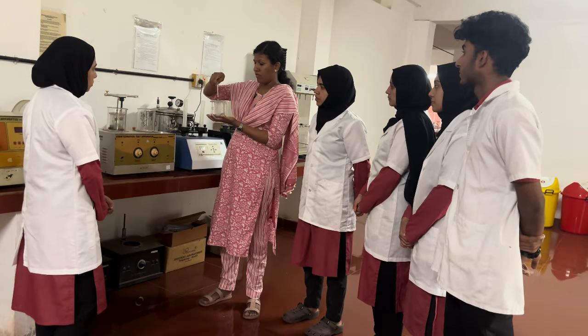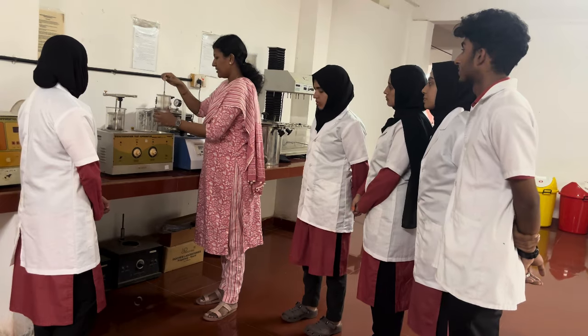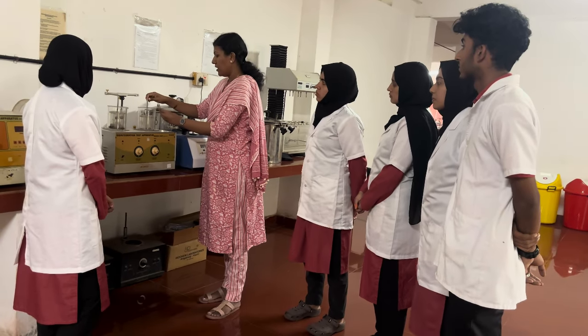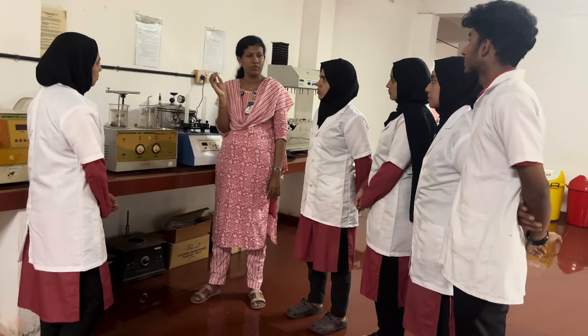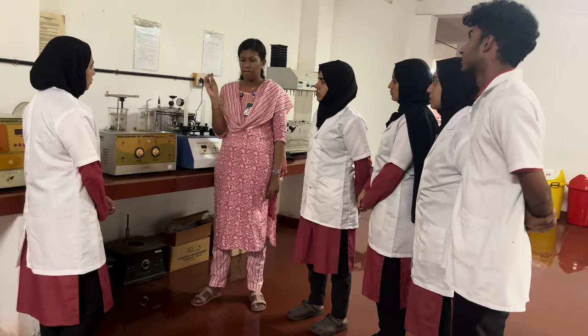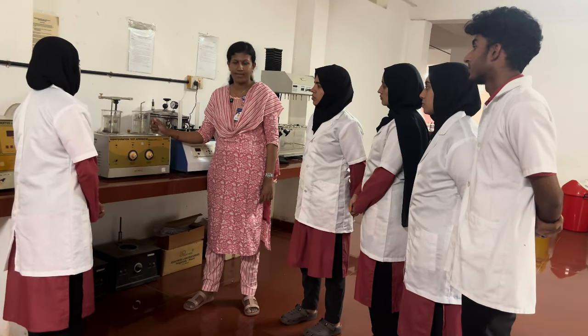Okay, then we can see the disc. You already know about the disc. These are the plastic discs. What is the use of this plastic disc? Why are we using the plastic disc during the operation of the disintegration test?